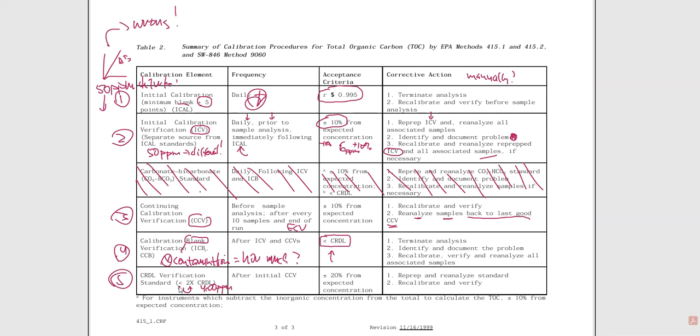So what this means is that I'm going to be preparing another quality control sample that's going to be added to the batch, and this is a verification standard, and it's going to be less than 4 ppm based on the contract that we see here, because it tells us the CRDL is 2 ppm. So less than 2 times that value. If it was a contract value of 1, 2 times 1 is 2. I need to make something lower than 2. I need to run it.